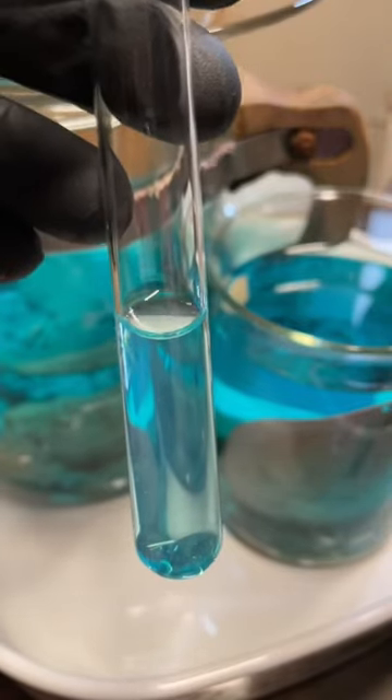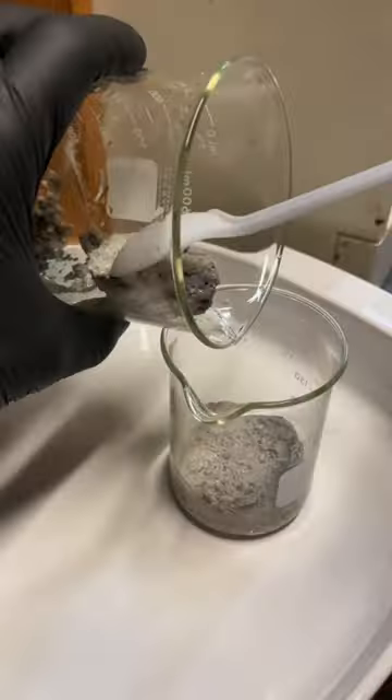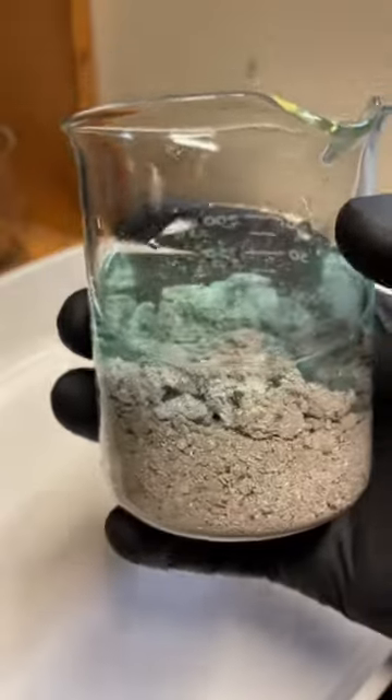Here we are the next day, looking like it might be done. I'll test a sample with some salt water and no change tells me that everything is dropped. Shake the last bit of silver off the church and after pouring off the liquid, combine it with some material from another project.